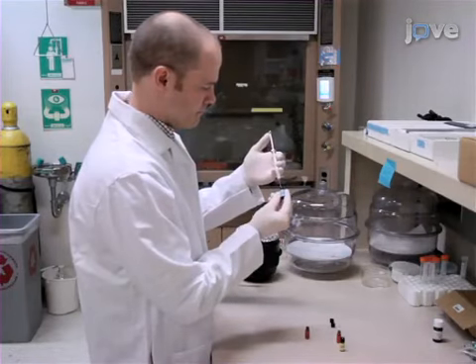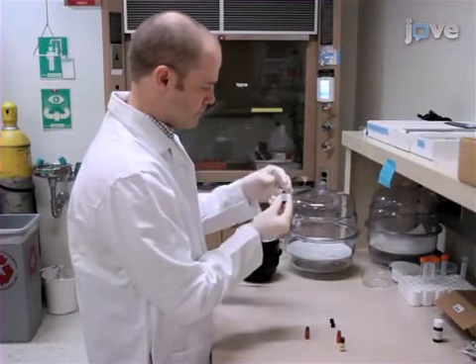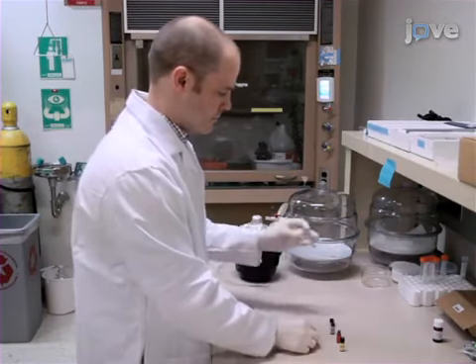Microwell arrays and squeegee preparations are detailed in the text protocol. This video begins with vesicle preparation.